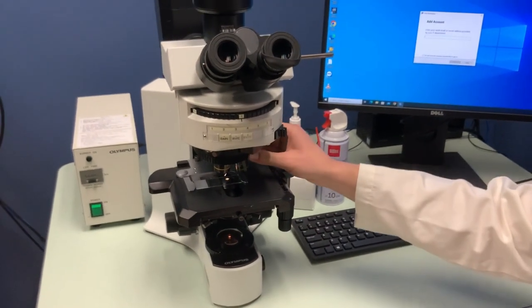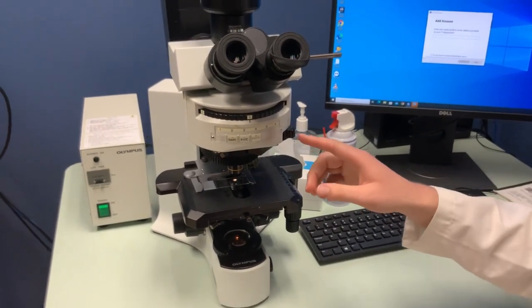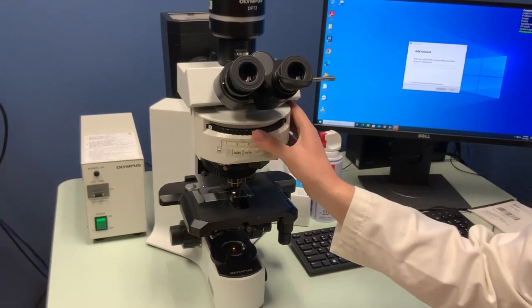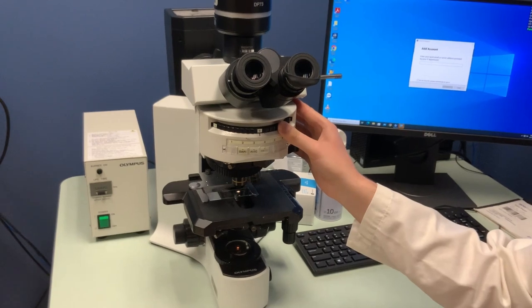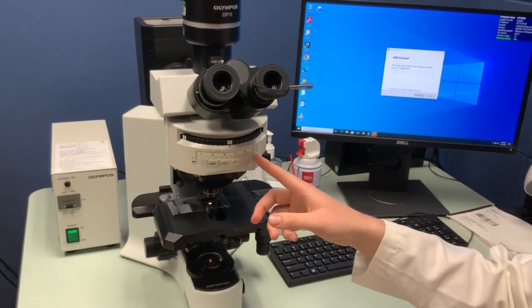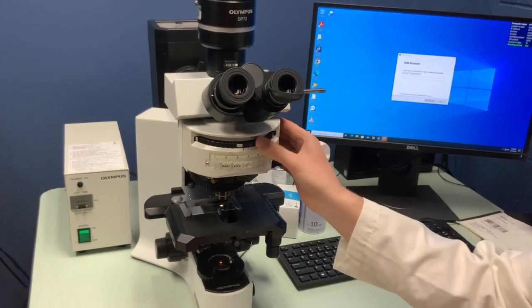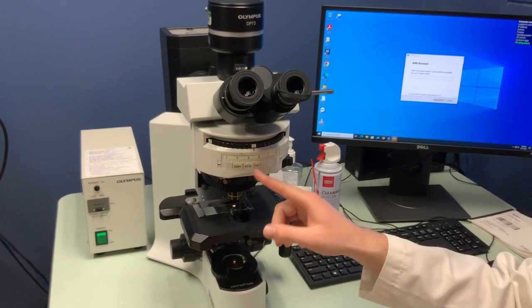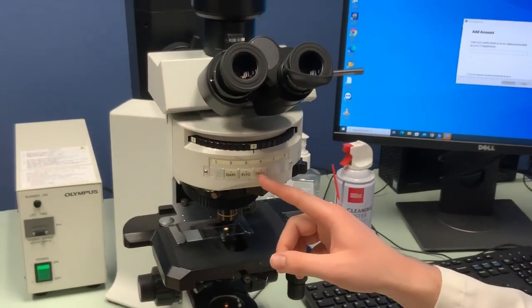This turret turns manually. For bright field, we don't have to worry as much about these different filters. You can put it on position six — there's no filter there — or even position one. Positions two, three, and four will have DAPI, FITC, and TRITC filters.